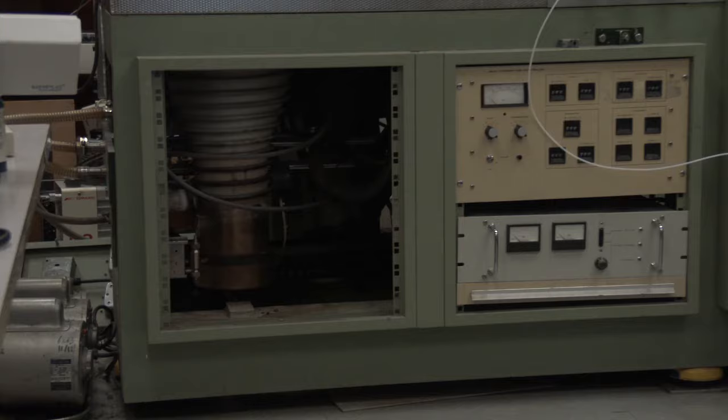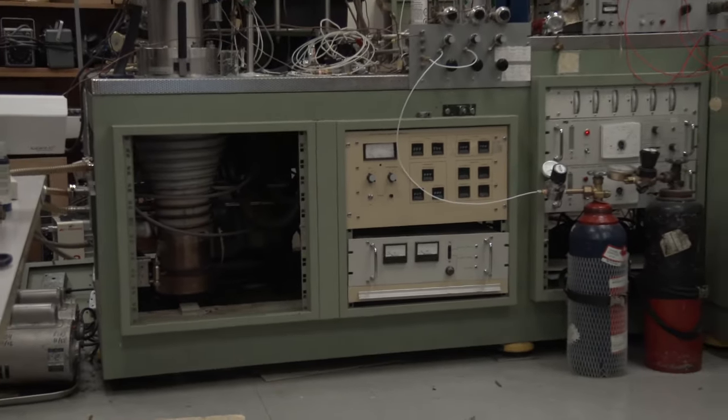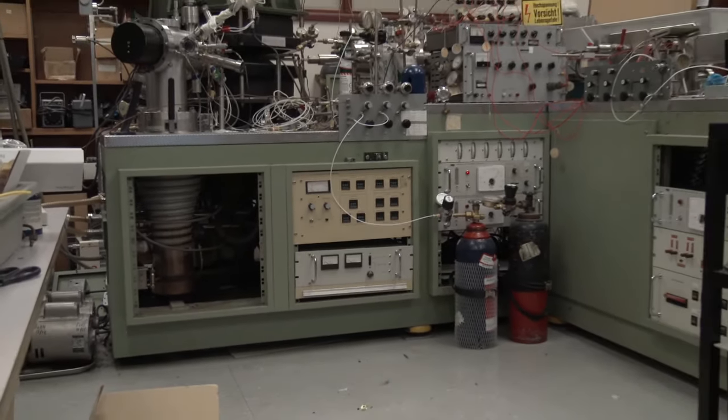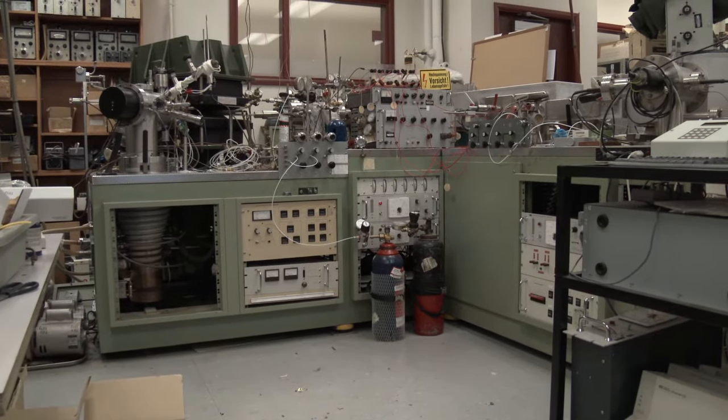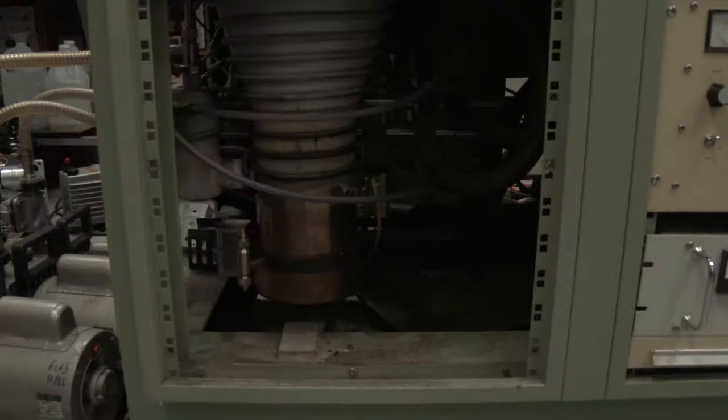As we pull back, you can see just how gigantic this experiment is. Modern-day instruments, however, are much smaller and can fit on top of a desktop.